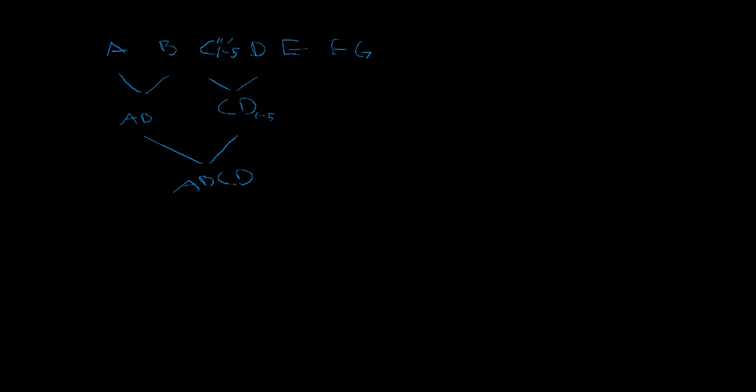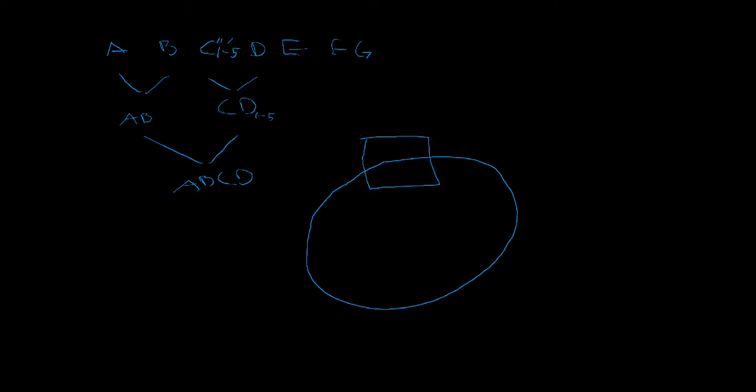In our lab, we have a series of these standard plasmids. I'm going to draw out one of these plasmids. A nice circle. Oh wow, that started out nicer. So here's our plasmid, and we'll say that this plasmid has part A in it.